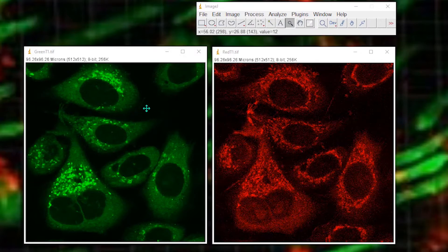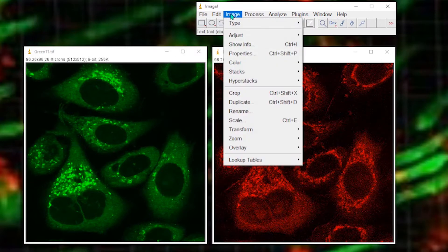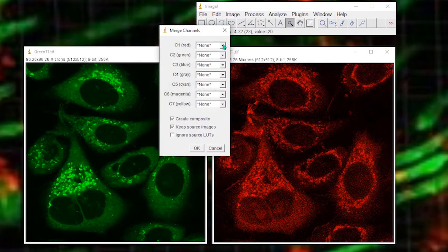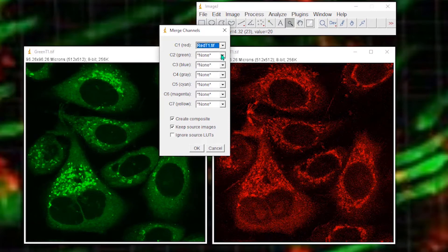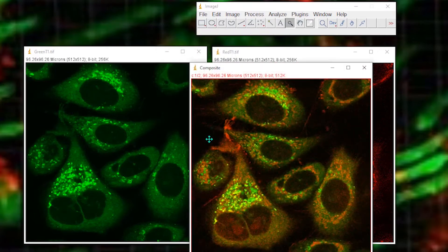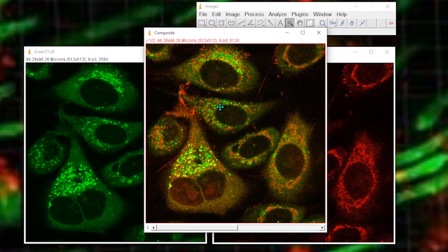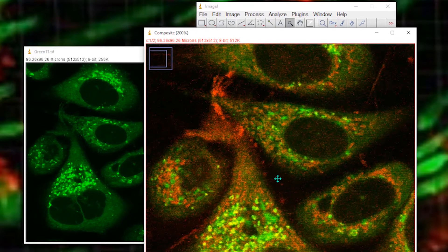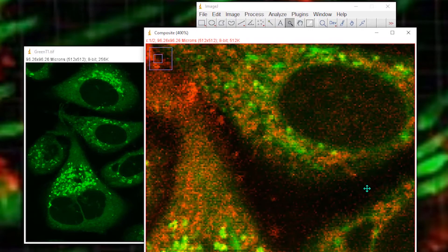Let's take these two images, the red and the green, and merge them using the merge channels function. My red channel is red T1 and my green channel is green T1. If we zoom in, you can see that in the background between the cells there's quite a bit of noise, particularly in the red channel — it's quite noisy.